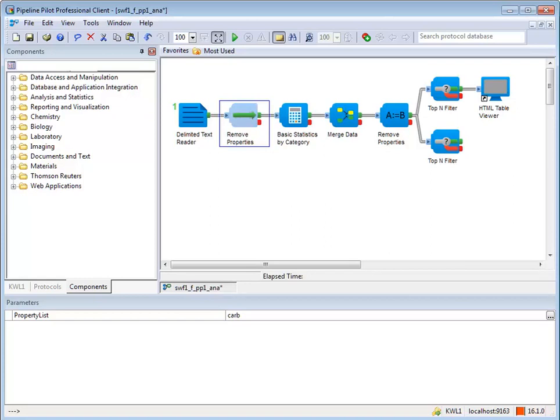This is the pass data state. Data passes through the component and out the pass port as if the component was not in the pipeline.